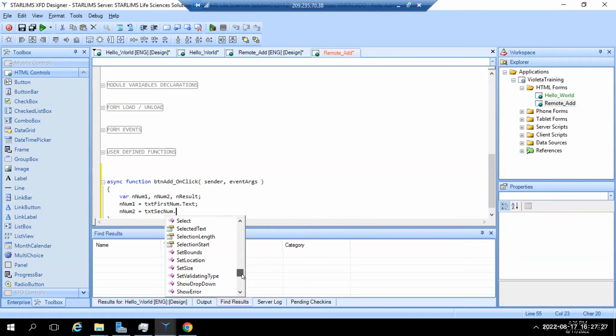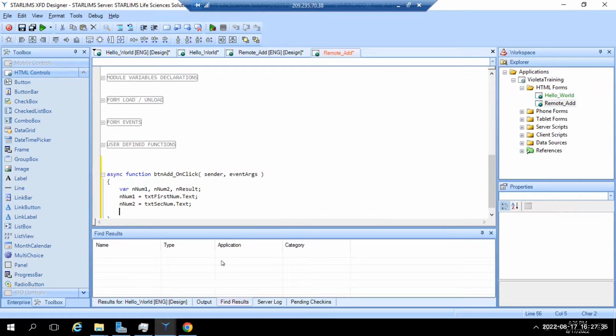And you can start typing and then it gets you to the, there you go. Yep. And then hit enter, or tab enter, I forget. Yeah, and then, okay. So now we're gonna say end result equals, you know, n plus this, num1 plus num2.